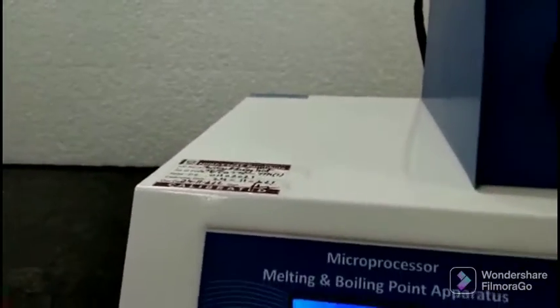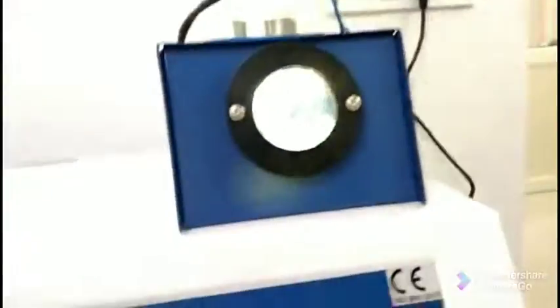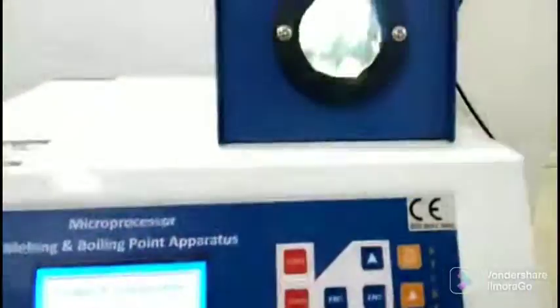You also see that there is a sample showing on this hole given on this platform. Just put your sample in this capillary and put it inside your heater. When you put the capillary in your heater, you see some sample showing on your platform. When your sample is going to melt, the melting point is shown on your instrument.